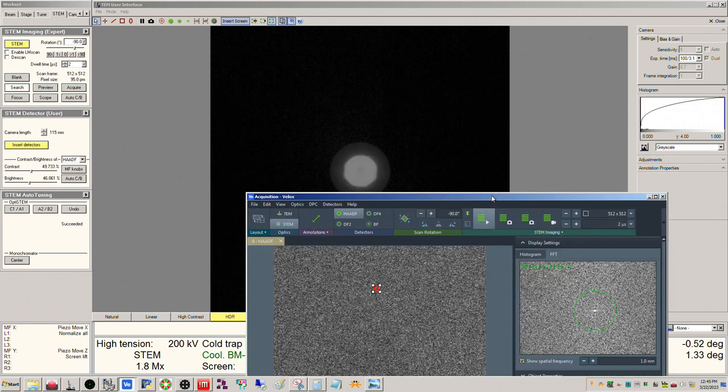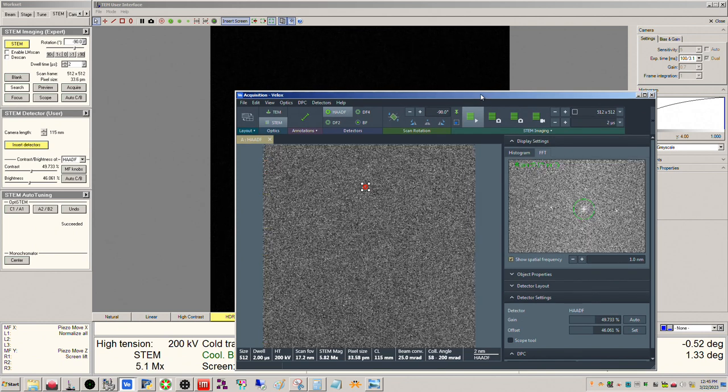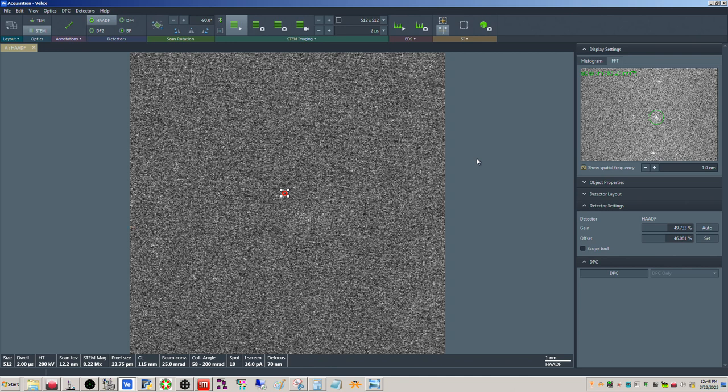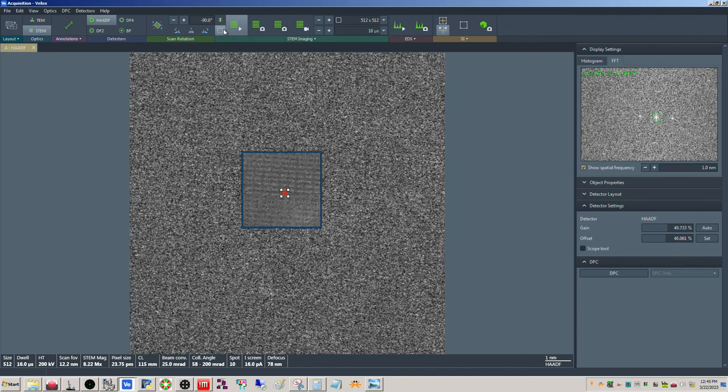It gets a little tough though when you're looking through nothing here, or just an empty area. All right, let's try running A2, B2 again here, just for fun. Or maybe not before we do that, let me stigmate the image again. It looks like the twofold is corrected well. It's going back and forth okay. Let's try running A2, B2 again.